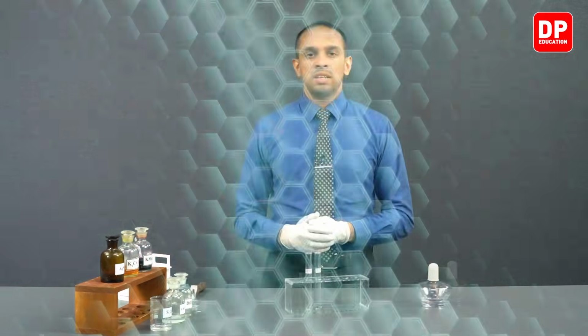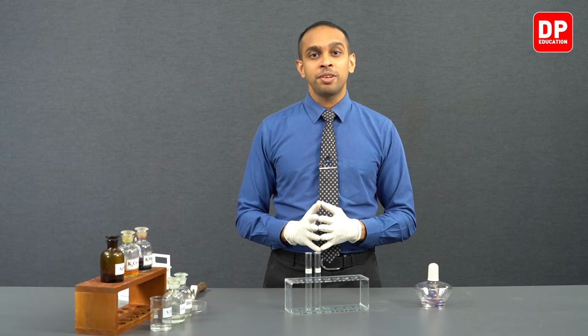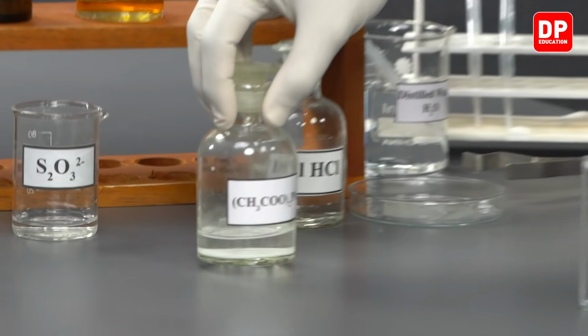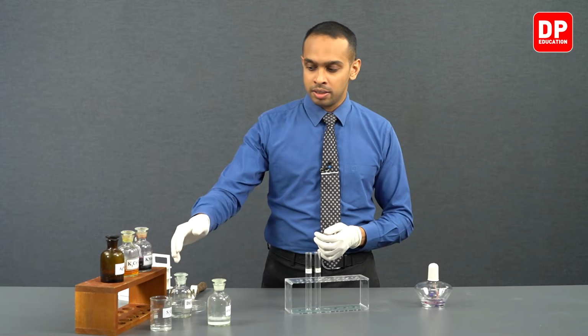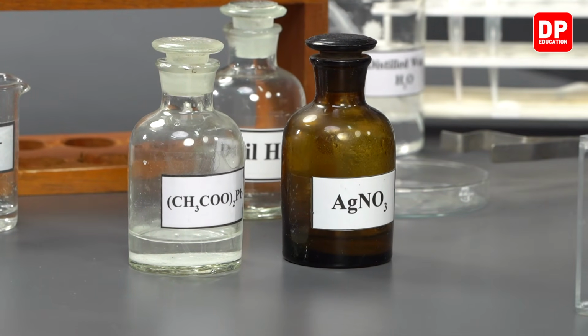thiosulfate ions. Now everyone, we are going to observe how the thiosulfate ion solutions will react with silver plus ions and lead 2 plus ion solutions. So to obtain lead 2 plus ion solutions, we have lead acetate, and to obtain our silver 1 plus ions, we have silver nitrate.